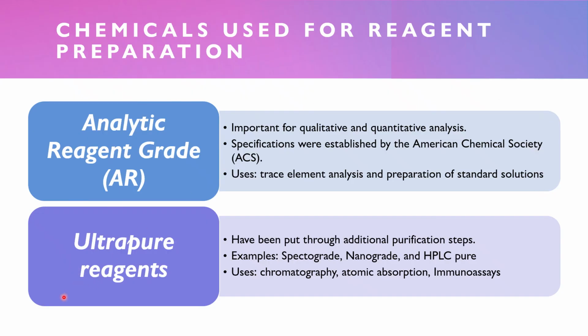For ultra pure reagents, ultra pure chemicals have been put through additional purification steps for use in specific procedures such as chromatography, atomic absorption, immunoassays, molecular diagnosis, standardization, or other techniques that require extremely pure chemicals.